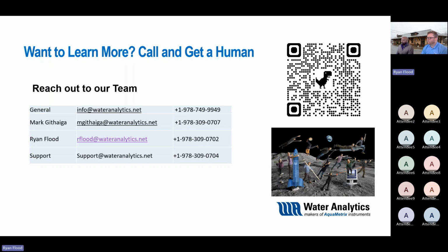Another question we have is related to resistivity. If you have an application that requires resistivity measurement rather than conductivity, how would we handle it? Yeah, so the easiest way to do it is probably going to be through switching the value. With a smart sensor, you can get your input out and go into a control. You can provide that inverse, and you can look at it from the raw or temperature compensated perspective.